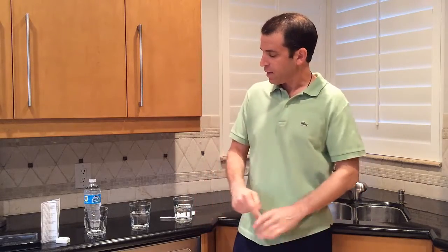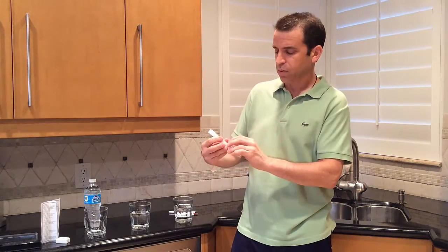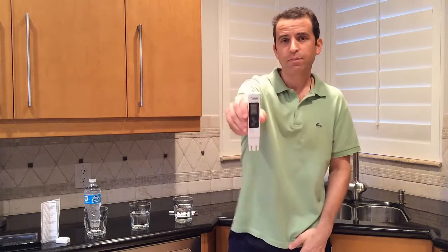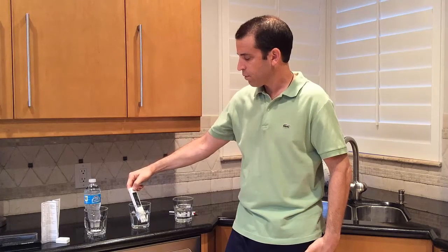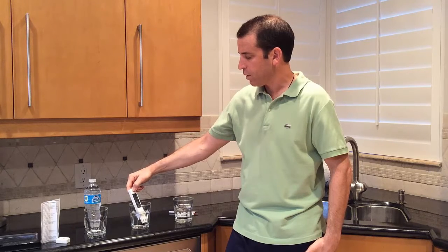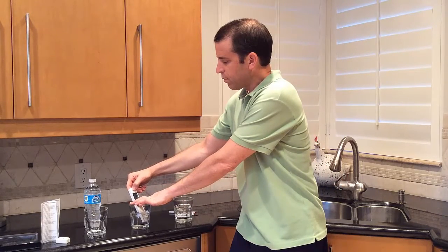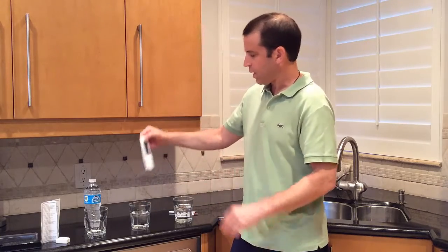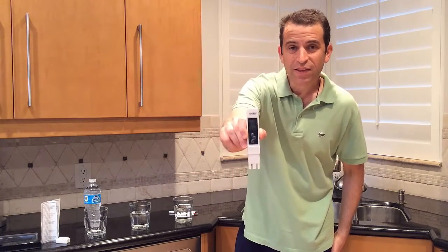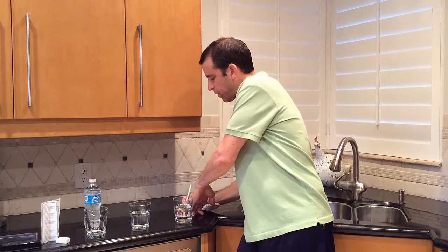Now we're going to test the refrigerator filter water. I can turn this off and back on, or just press the hold button — and now it's back to zero. I'll immerse this into the refrigerator filter water. I've got a reading; I'll keep it there for a minute. They say the longer you keep it in there, the more accurate the reading. Let me press hold — 139. This is filtered water, 139 — pretty close to the tap water.